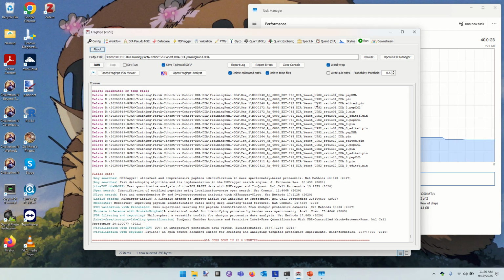The case of DIA is quite different. DIA collects tandem mass spectra on a schedule, and it doesn't have the one peptide, one MS-MS expectation. The idea in a DDA experiment is that each MS-MS is evidence for one particular peptide.